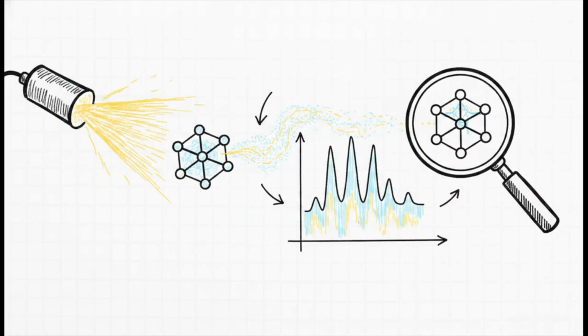The sheer power of XRD lies in its ability to take the invisible atomic structures of our world and decode them using just a single beam of X-ray light and some robust math. It completely transforms the infinitely small into measurable, actionable data. You've got the tools to analyze these foundational structures right here. The only question left is, what will you discover next?